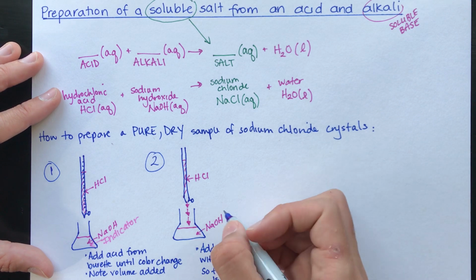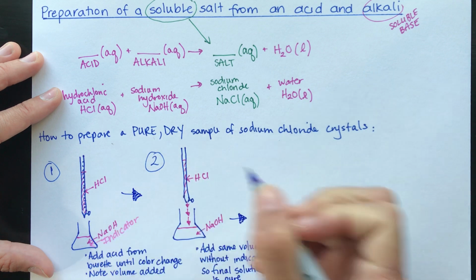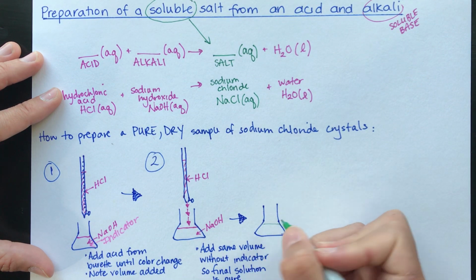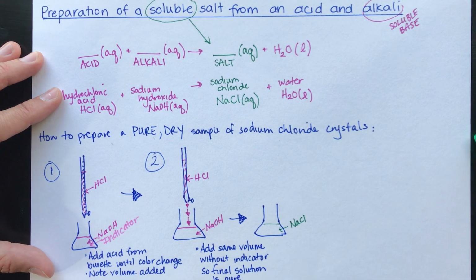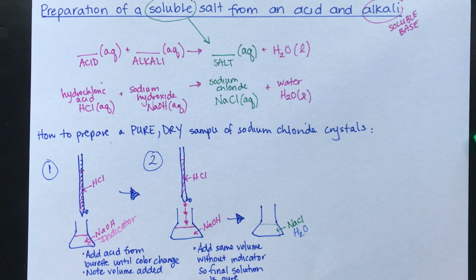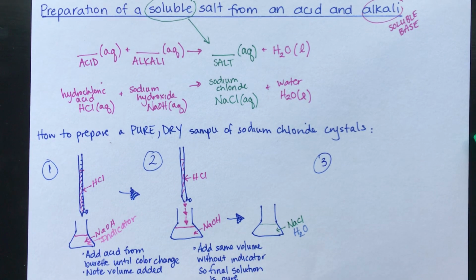All right, so this is going to give you a conical flask filled with only NaCl and water. Because it's a solution, you shouldn't have any leftover reactants, and the products, as you can see, are just salt and water. So now it's pretty easy. It's exactly what you did in the last experiment. You simply need to get rid of the water.